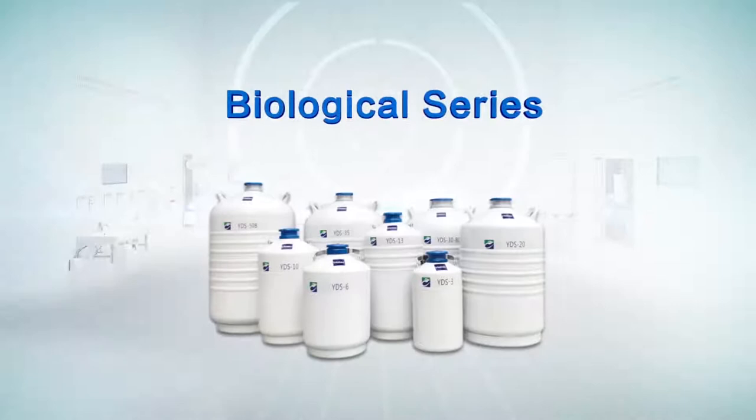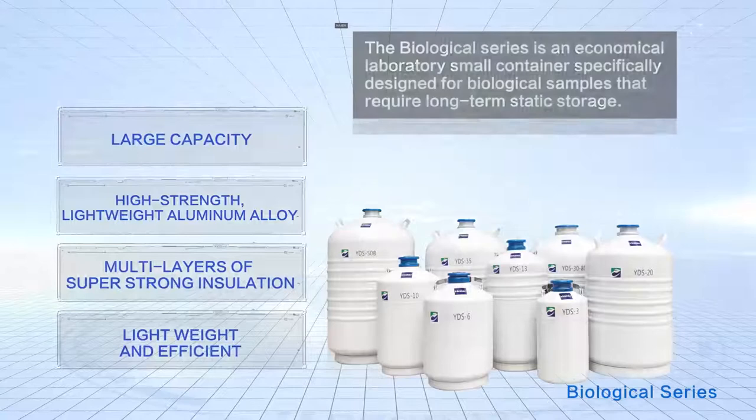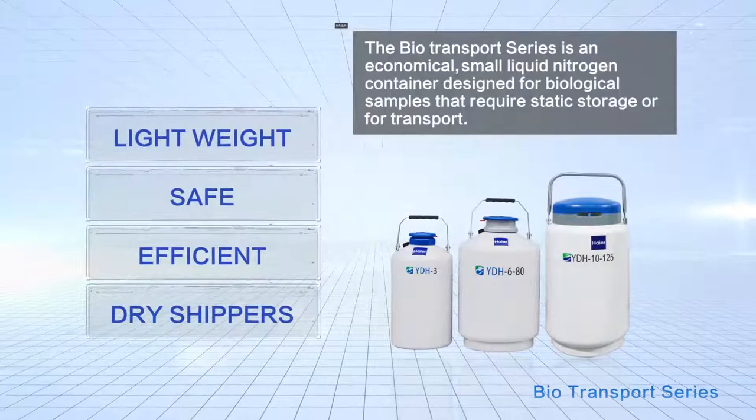The Biological Series is an economical laboratory small container specifically designed for biological samples that require long-term static storage. The Biotransport Series is an economical small liquid nitrogen container designed for biological samples that require static storage or for transport.